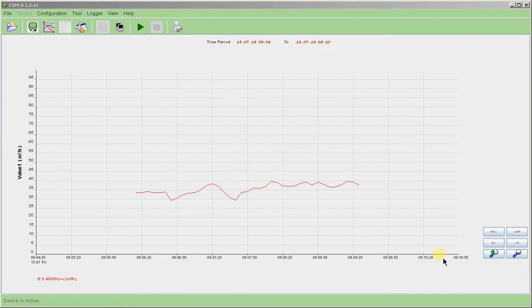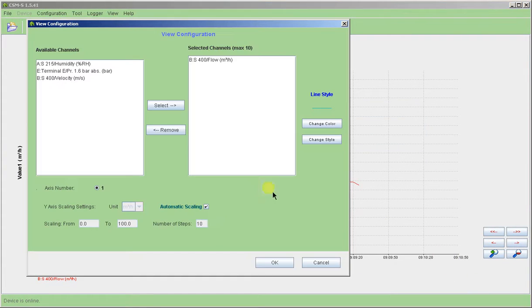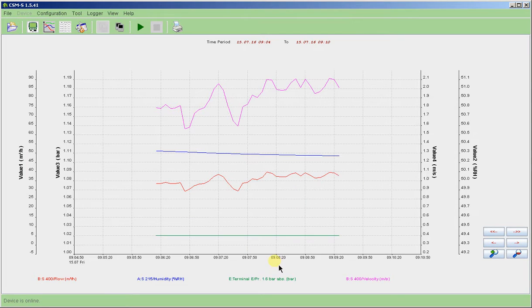Select that. Now, view configuration. We were doing different variables on this run. And that's the one I did earlier today. And again, we can then go and export this as a CSV or an XLS, ready for use.